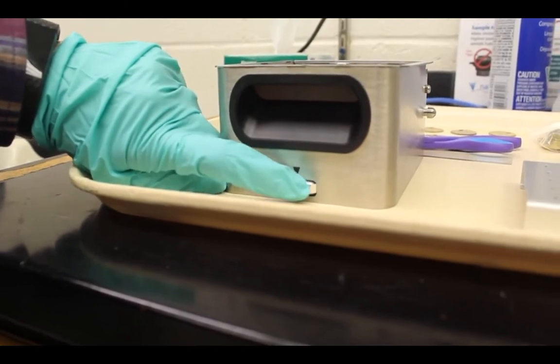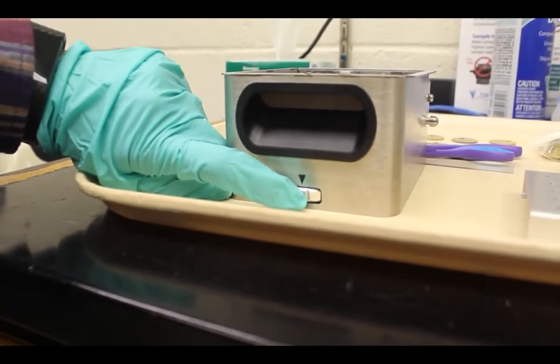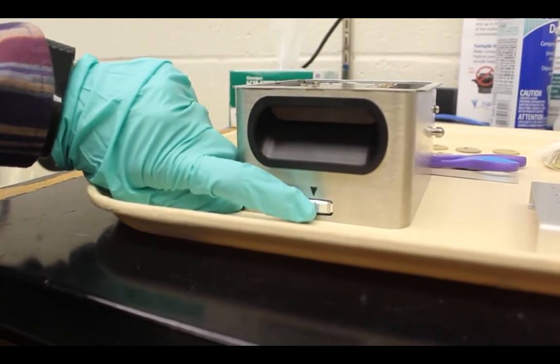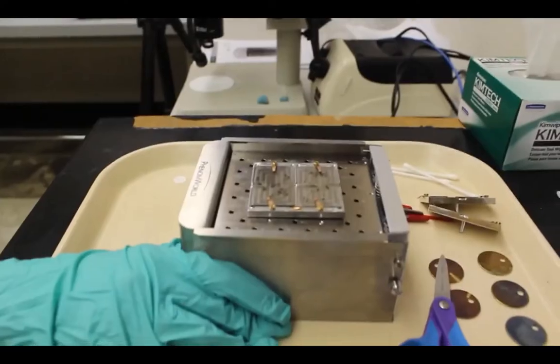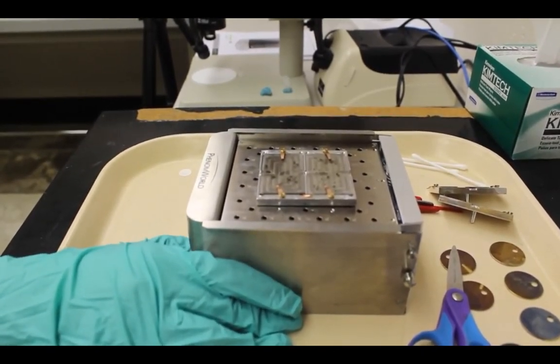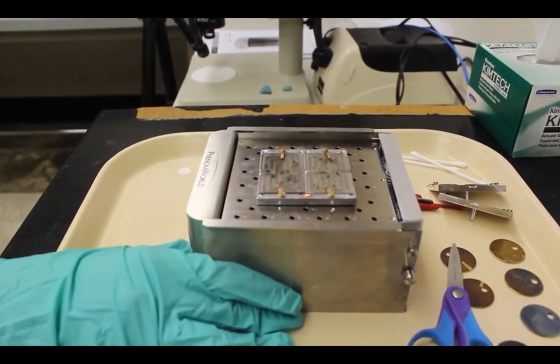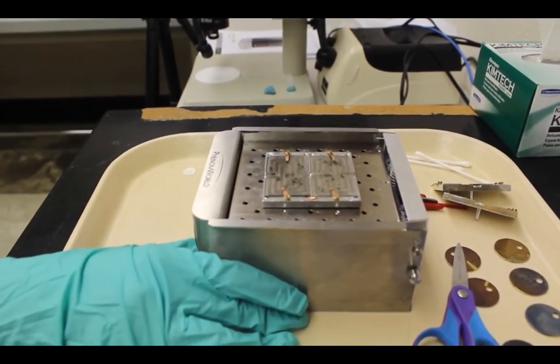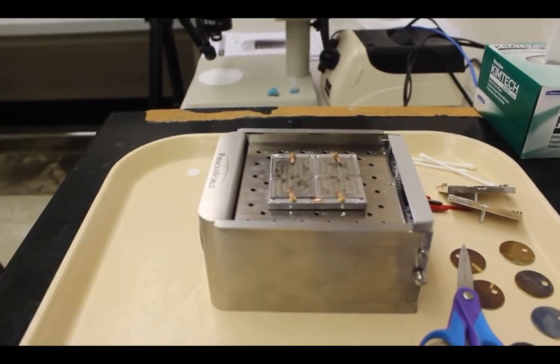It's necessary to move the sample so that its top surface is below the top surface of the sample holder. We're going to first move the sample so that it is level with the top surface like this, and then using the dial on the side of the sample holder, we move it down by six units so that the surface is an appropriate distance below the sample holder.